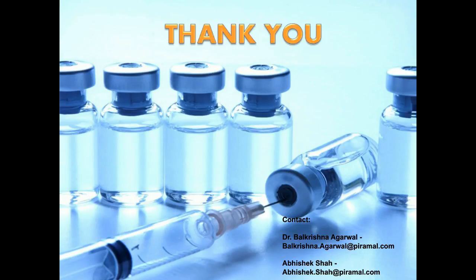Okay, thank you very much for that answer. And okay, here we go. So the next question is, which category of compounds are considered as highly concerned extractables?